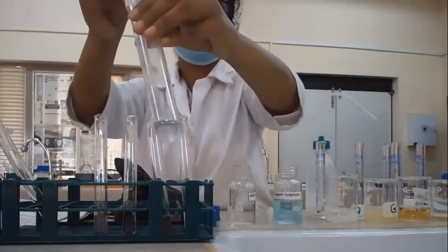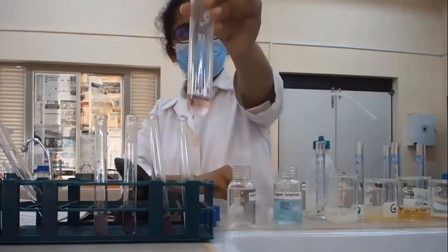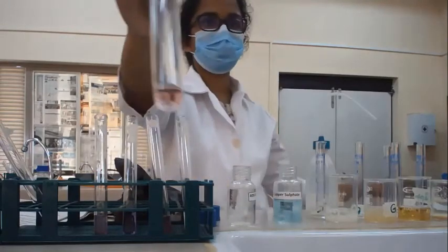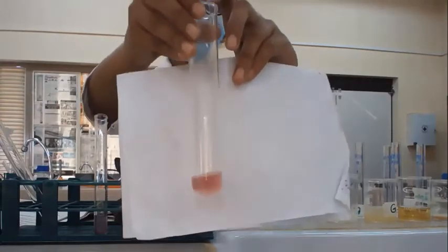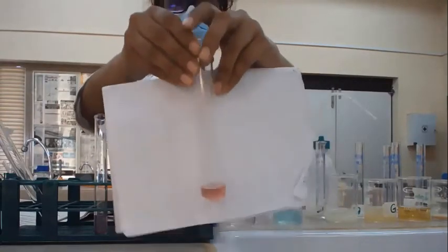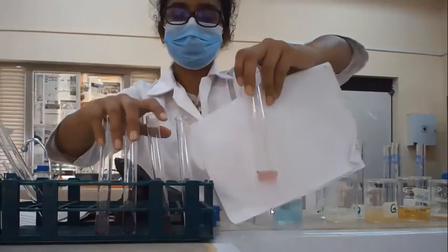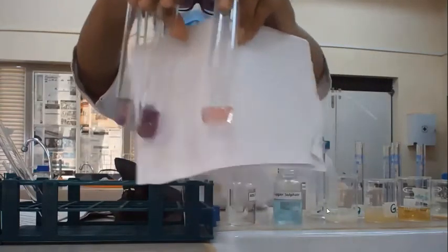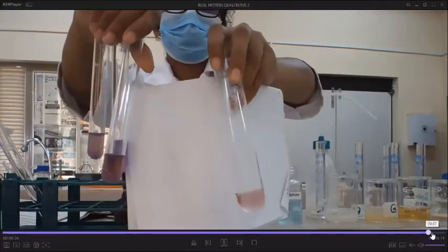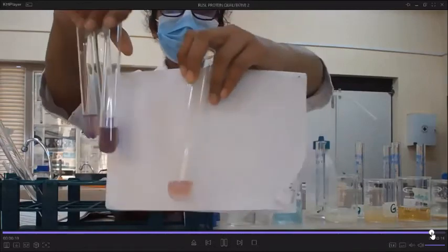You will see this urea also produces a color similar to the protein sample. See, here these are the protein samples, and this one is the urea sample. So it is a limitation that we face.